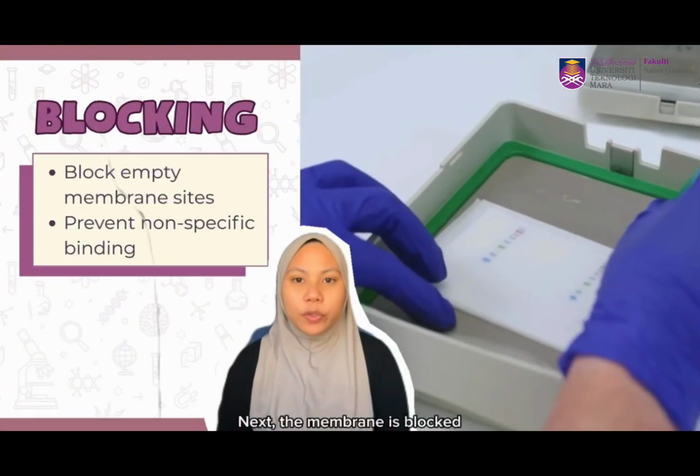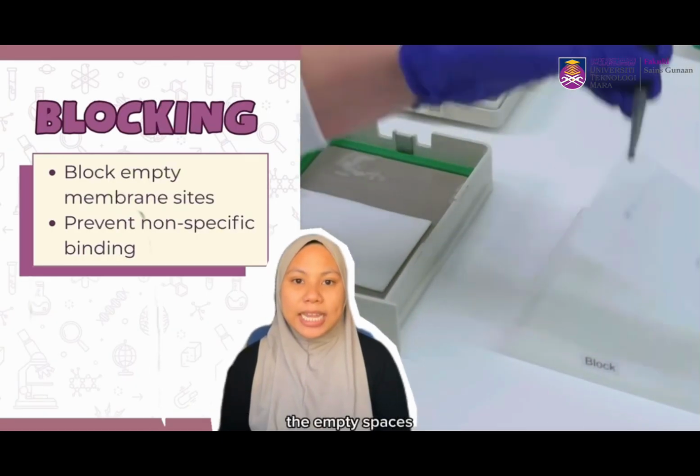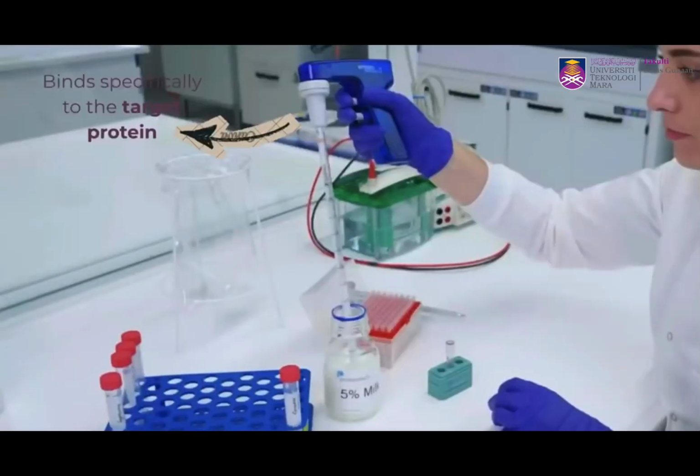Next, the membrane is blocked using a blocking solution such as non-fat milk or bovine serum albumin, also known as BSA. This blocks the empty spaces on the membrane and prevents non-specific antibody binding, reducing the background signal.